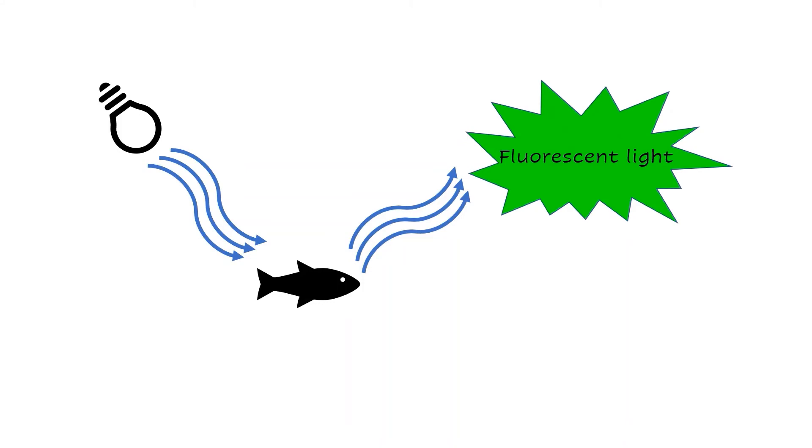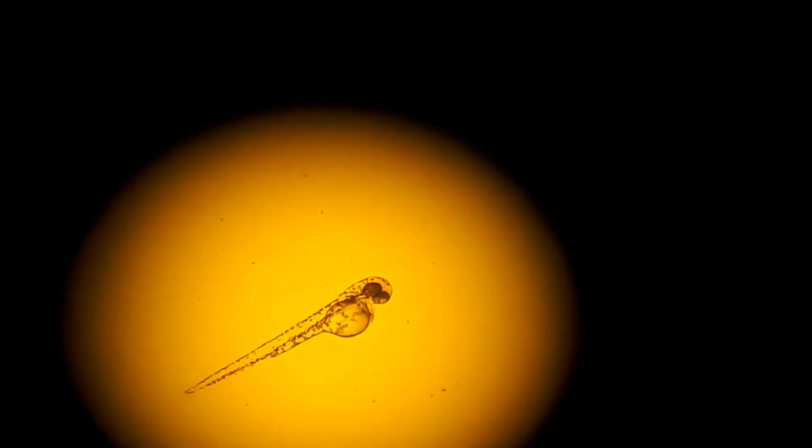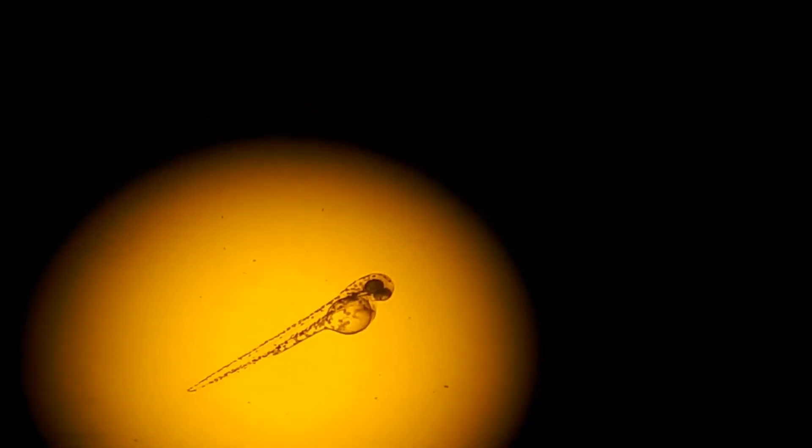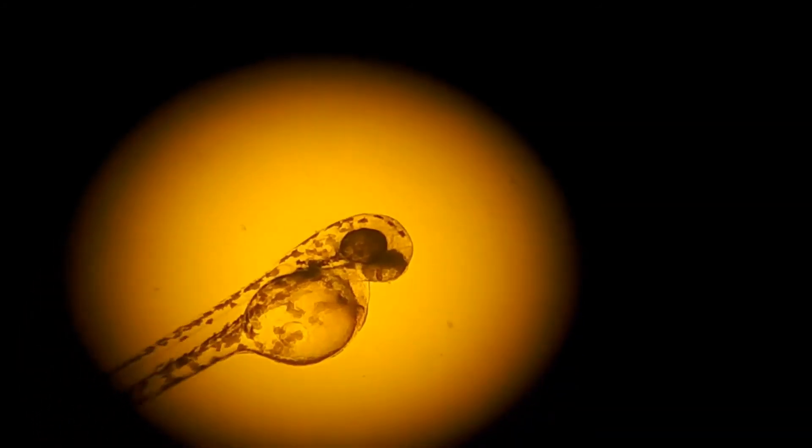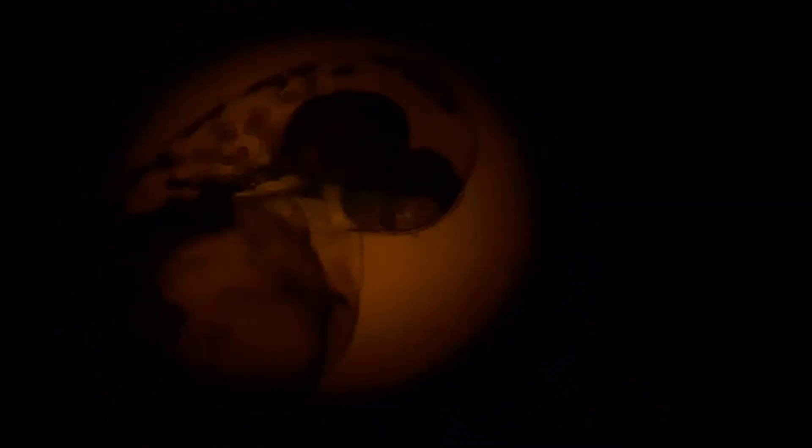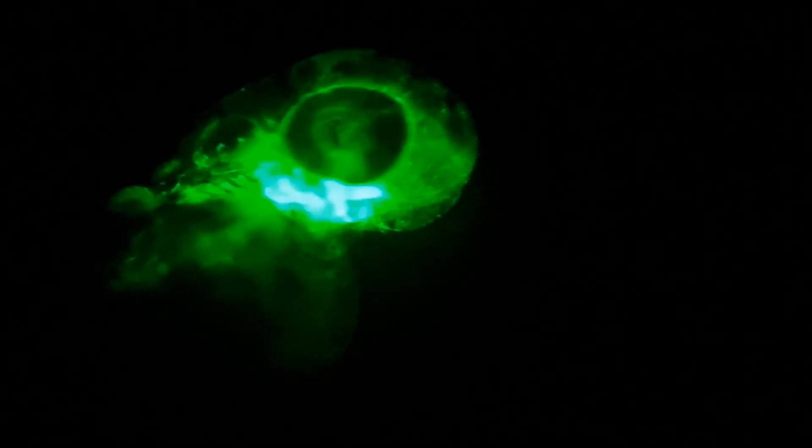Let's have a look at one of the fish under the microscope. So here's one of the fish embryos. If I zoom in a little bit, we'll be able to see the heart beating. There, can you see the heart? Now, if we turn on the special light bulb, it shines green. Look at the heart now.